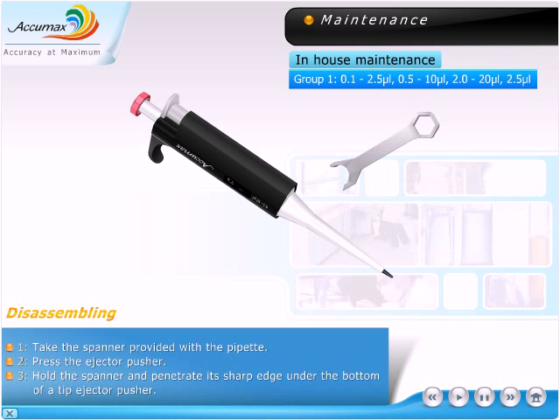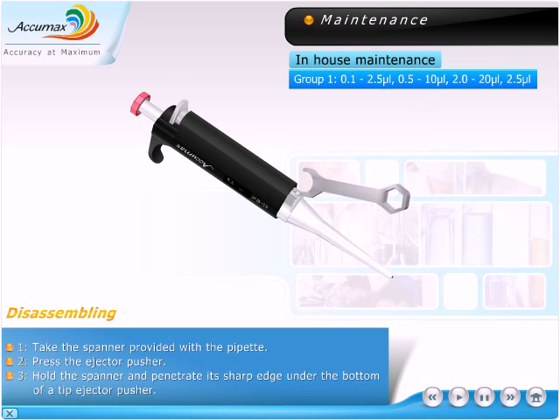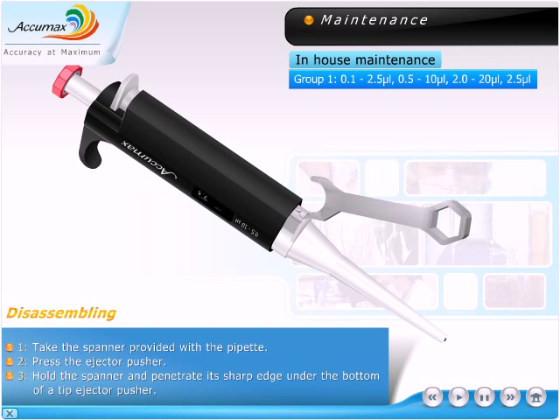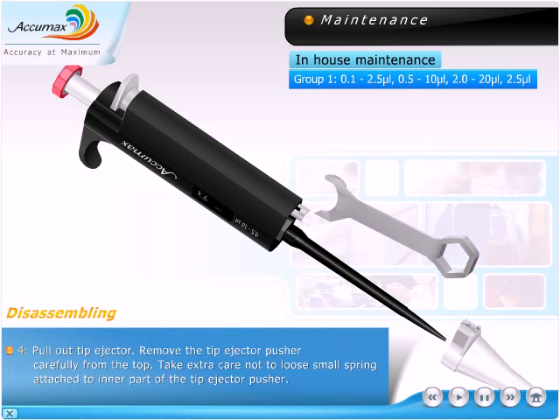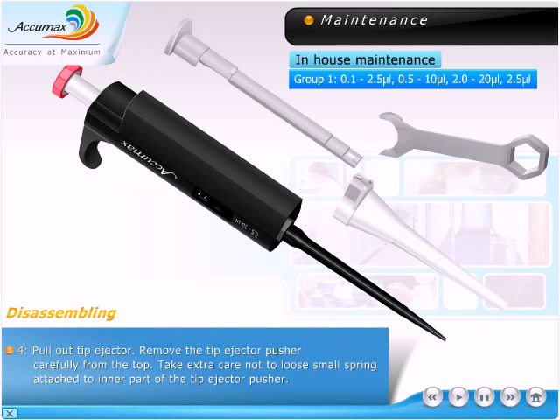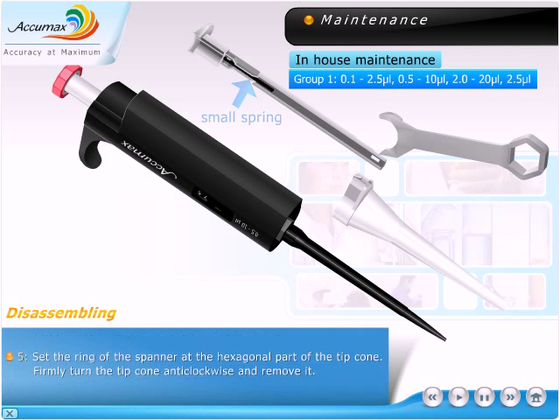Disassembling. Take the spanner provided with the pipette. Press the ejector pusher. Hold the spanner and penetrate its sharp edge under the bottom of the tip ejector pusher. Pull out the tip ejector. Remove the tip ejector pusher carefully from the top. Take extra care not to lose the small spring attached to the inner part of the tip ejector pusher.